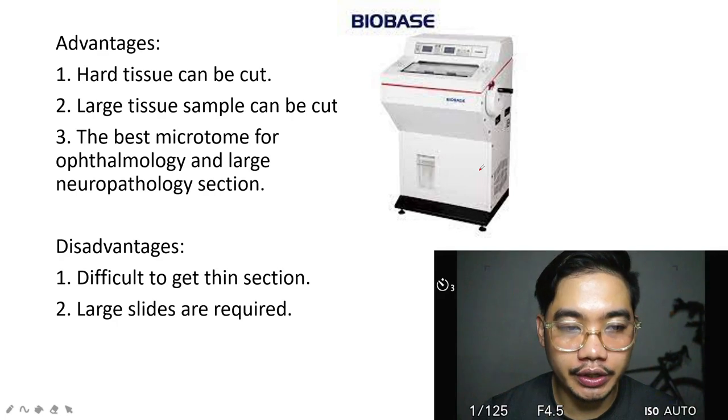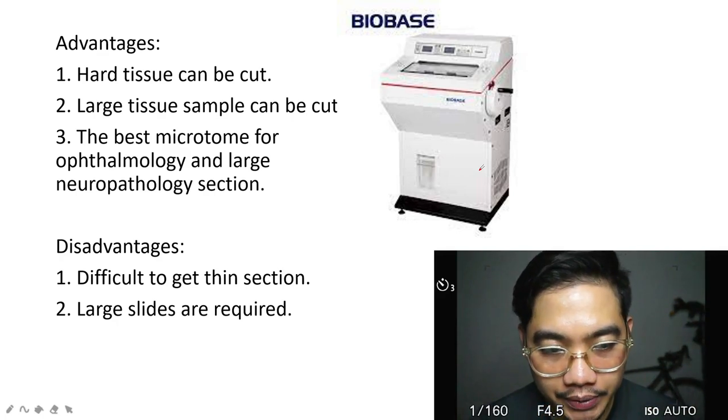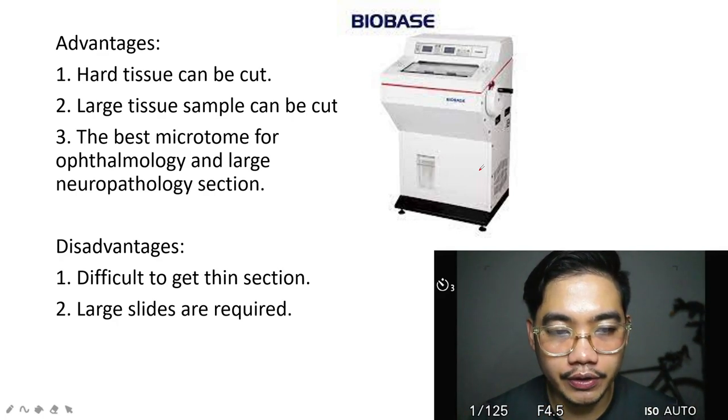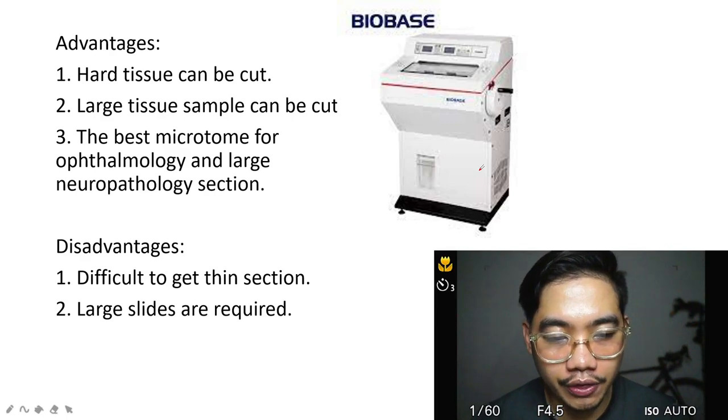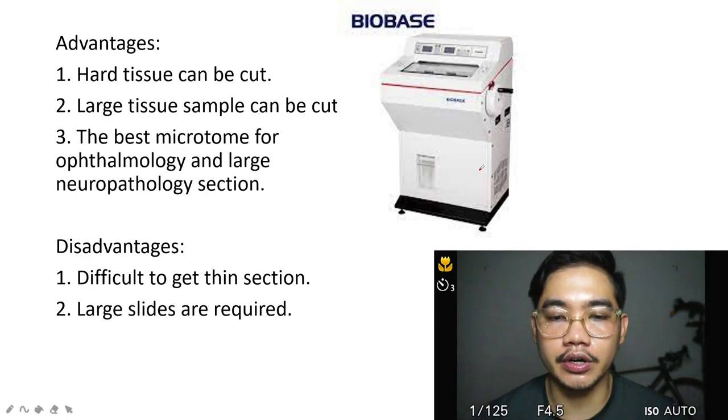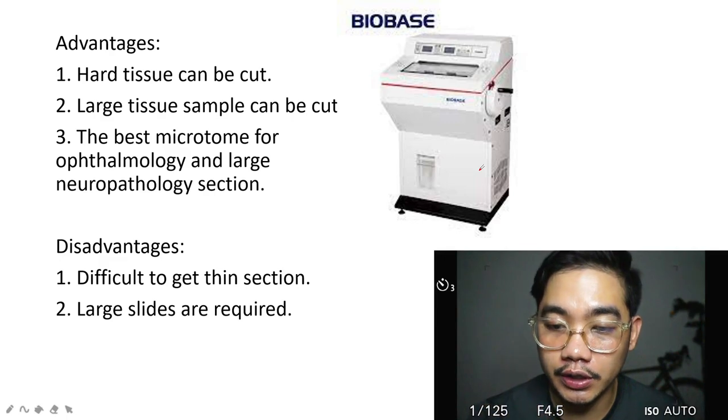So what are the advantages? Large tissue samples can be cut, the best microtome for ophthalmology and large neuropathology sections. What are the disadvantages? Difficult to get a thin section and large slides are required, because naku lagi siya na specimen.